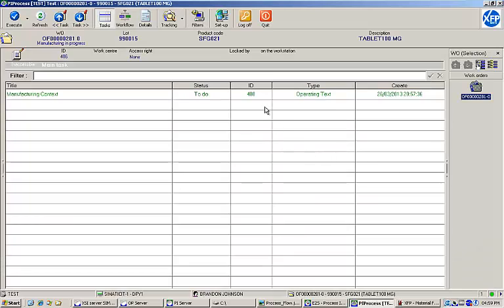The status bar at the top of the screen shows the currently selected work order number, as well as other relevant information like the lot number and the name and description of the product being created.